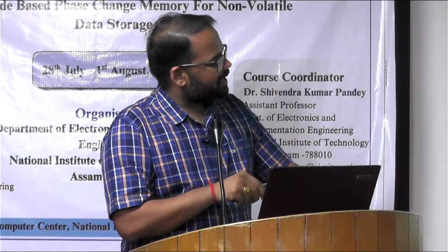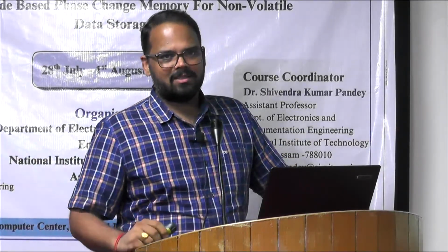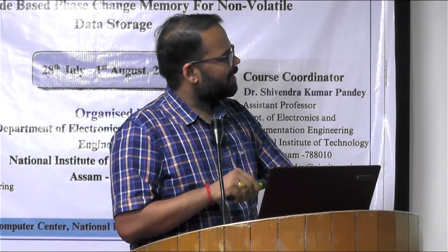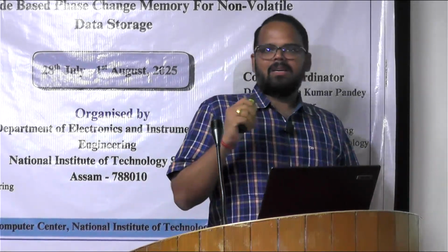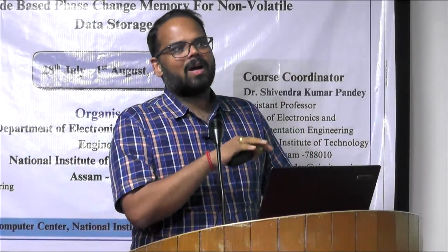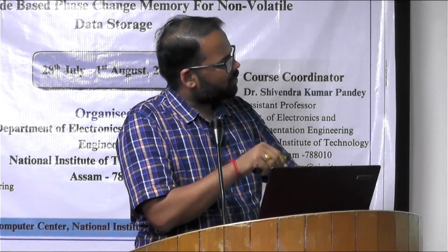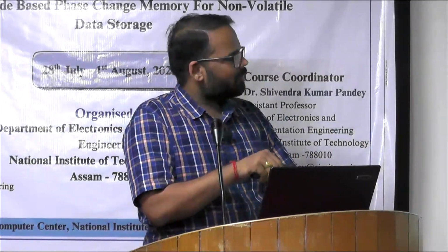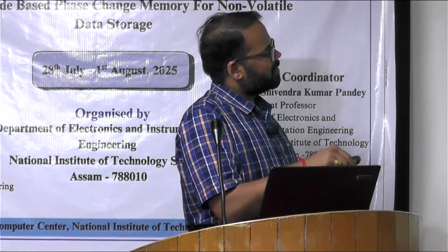So here, it's a kind of low cost switching matrix. You can simply use the relay, and you can control this with data acquisition. With this setup you can connect your one SMU, and it provides the beauty that you can change the terminal. Here these connections are coming for your source and sense, and here it is going to your sample, and through this NI based data acquisition, you can control it.